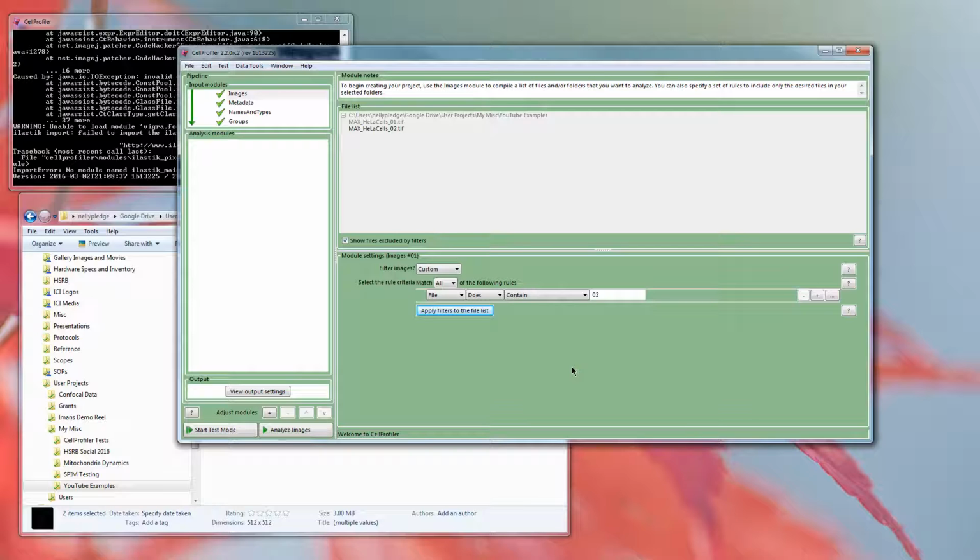So it's nice to go back and make sure your acquisition suits your analysis, and you can do this in an iterative process. But you can also, when you're setting up your analysis, try a few different types of images you have, or a few different images from the same acquisition. It's good to stick to the same magnification, for example, and the same experiment, and then you can have different pipelines or different projects here for different types of cells and things that are somewhat different in some cases.